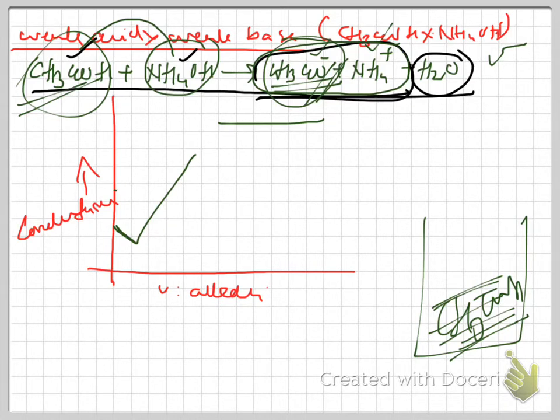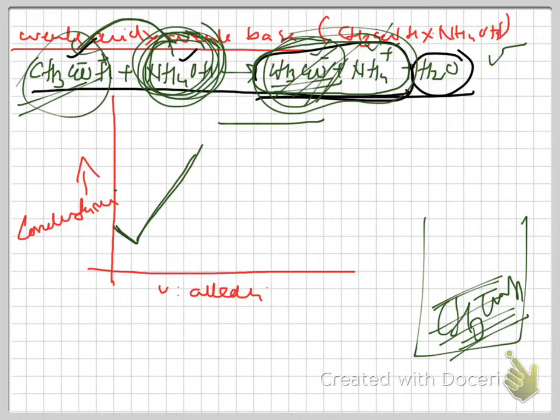That means the number of ions from the acetic acid decreases, as their dissociation is suppressed by this acetate. When excess NH4OH is added, that is the explanation for this region. Which region? This region. When excess NH4OH is added to acetic acid, a large amount of salt is formed. Then a large number of acetate and ammonium ions are formed, both in large excess. Due to the presence of this many ions in solution, conductance slowly increases, and finally it reaches the end point.